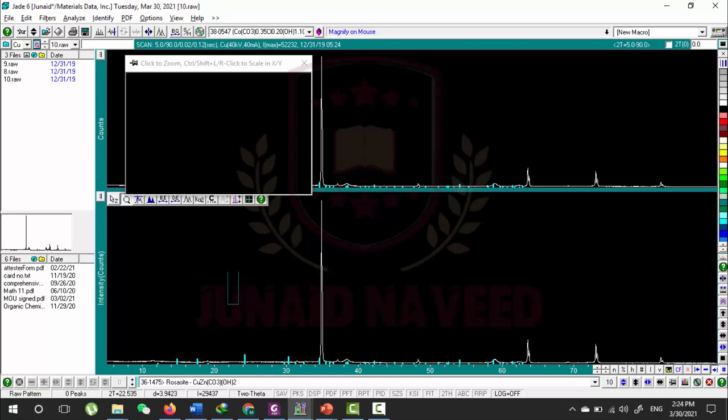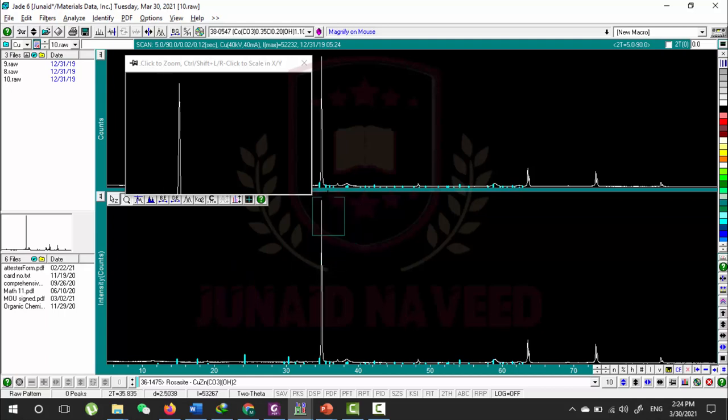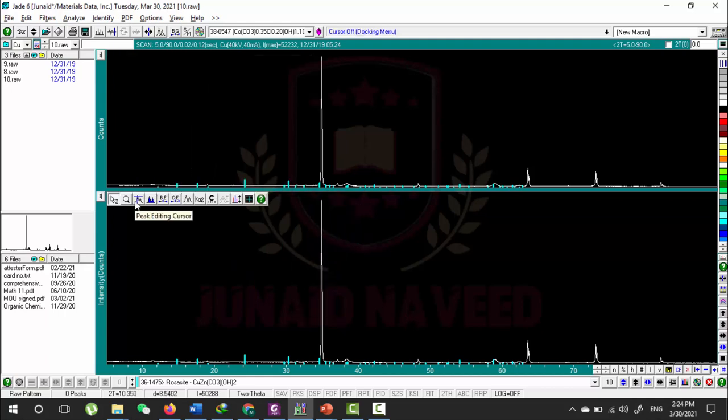If you hold the Control key and right-click, it will change its width. You can see it is changing its width. If I right-click, it will again increase the size of the width.